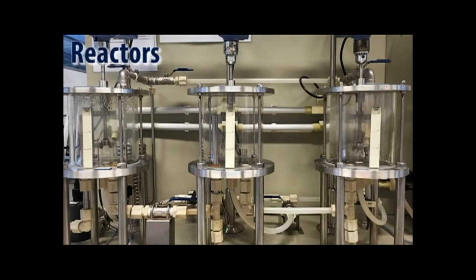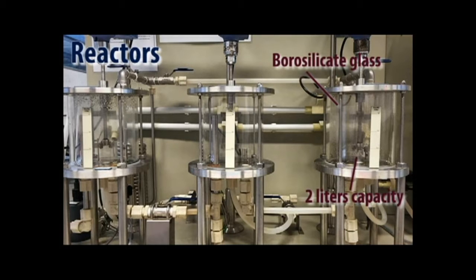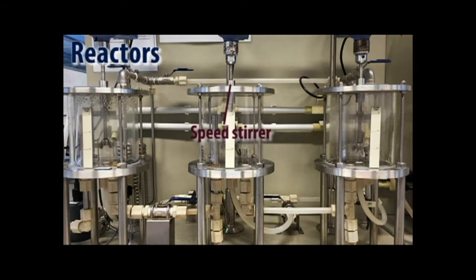In this CSTR, we have 3 reactors: Reactor 1, Reactor 2, and Reactor 3. These 3 reactors are made up of borosilicate glass with 2 liters capacity each. It has speed stirrer, temperature and conductivity sensor in each reactor. Overflow tubes are also provided in the second and the third reactor.